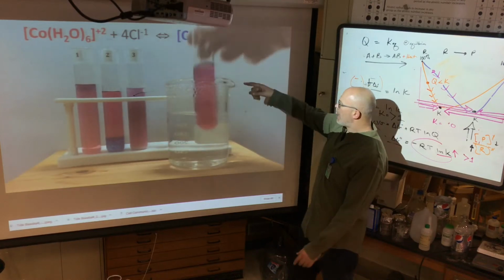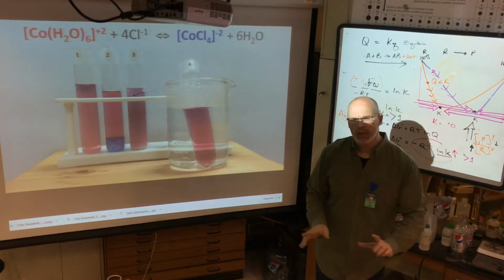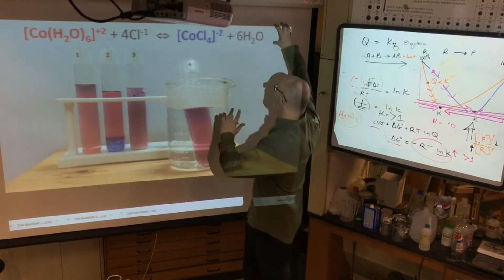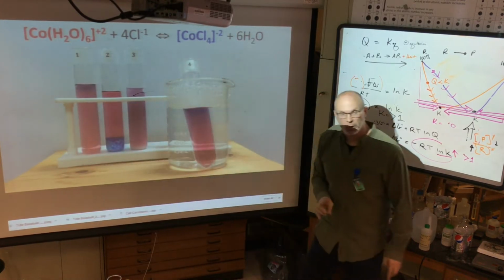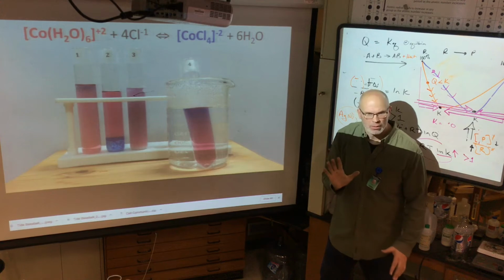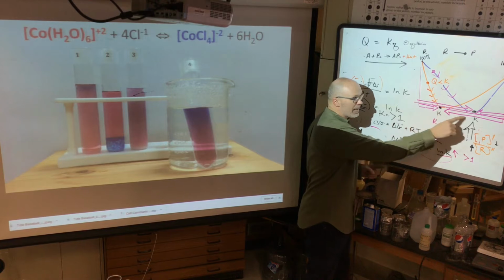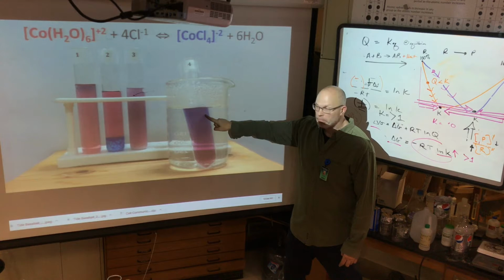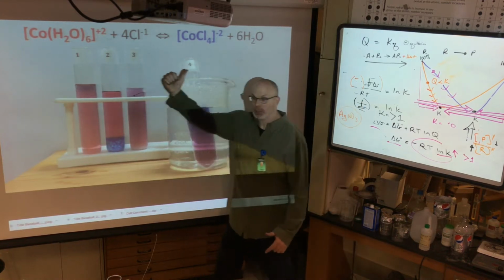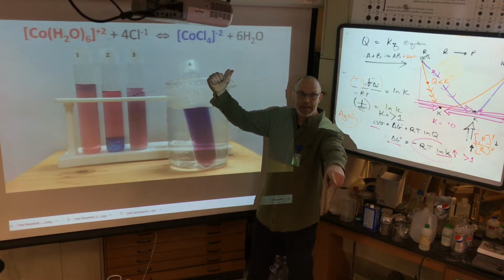Now, I'm going to put this in hot water. The reason I'm doing this is I'm asking my students, is this an exothermic reaction? Is the heat here, or is the heat here? Am I shifting this equilibrium? Am I shifting Q here? I'm changing the heat. What am I shifting? The K. What's happening? It's going blue. We see that more products are being favored. Why? I added heat. Heat always favors the exothermic or endo.